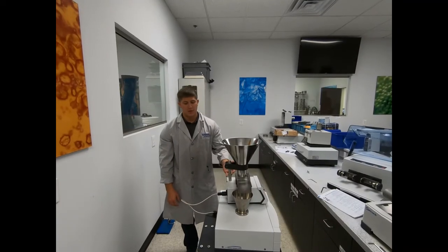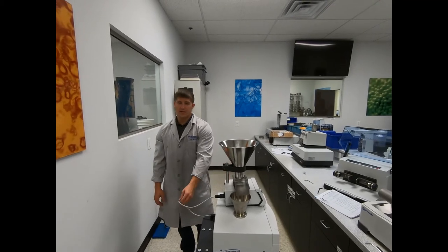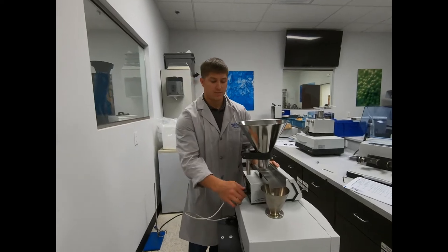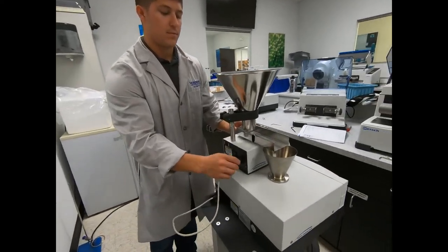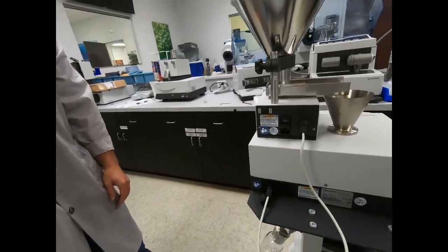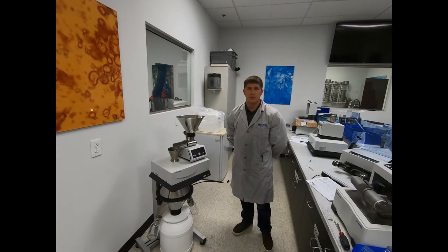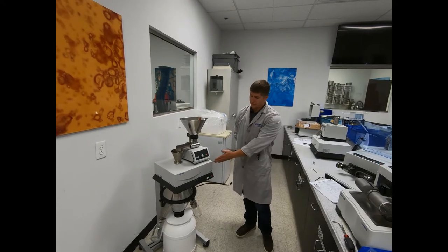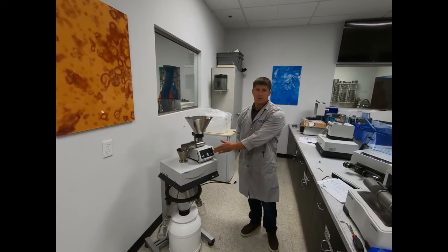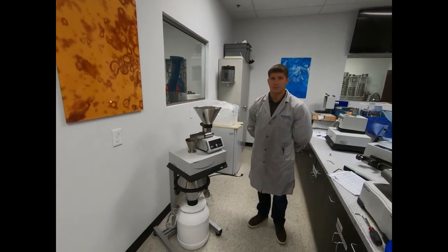To sync the two units together, take your provided data cable and insert it into the back ports of each unit. Once all steps are completed, you will now have a fully configured PT200 sample divider and DR100 vibratory feeder complete setup.